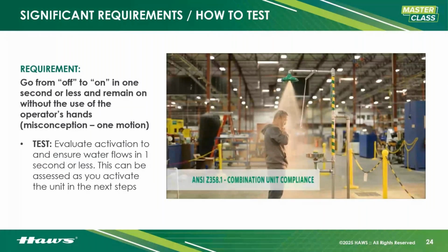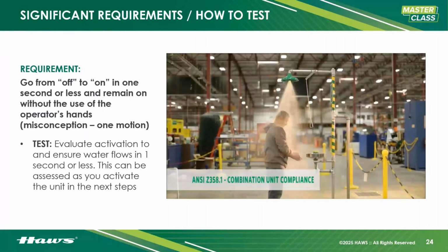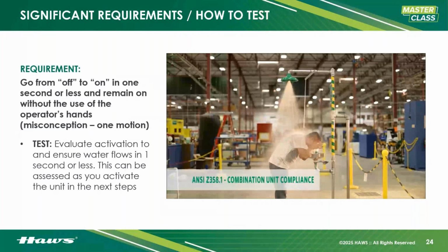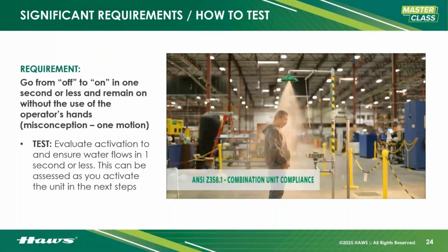Now, the actual requirement for the equipment is that it go from off to on in 1 second or less. However that has to happen, for instance, our equipment is all CSA certified to activate from off to on in 1 second or less for the Z358.1 standard. That's what you want to look for on equipment, that type of certification, okay? If you're getting your emergency equipment off of Wish, then please ensure it has those certifications and it has been tested and it does comply with the Z358.1 standard.